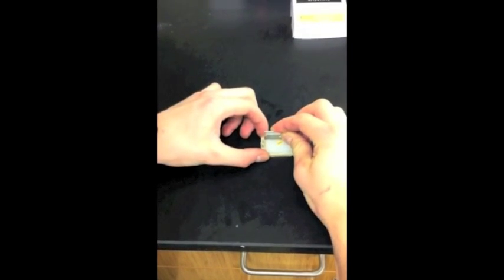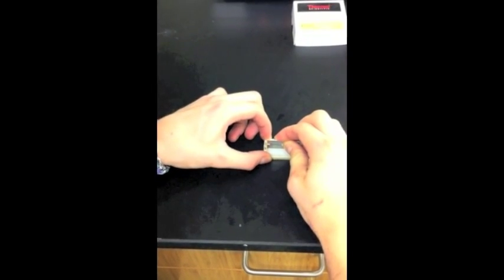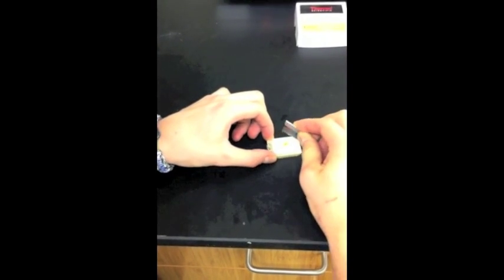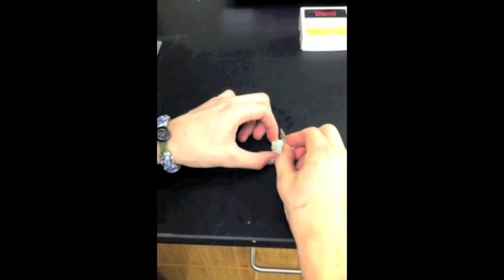To provide yourself with guidelines for removing excess paraffin, score the block with a razor in a trapezoid shape. The widest portion should be at the bottom.